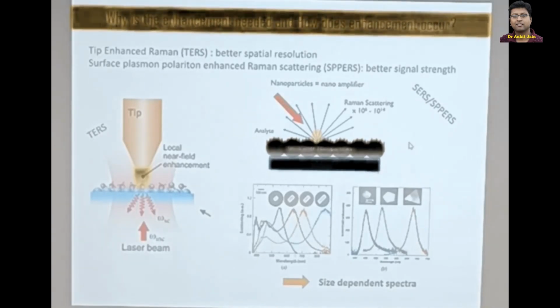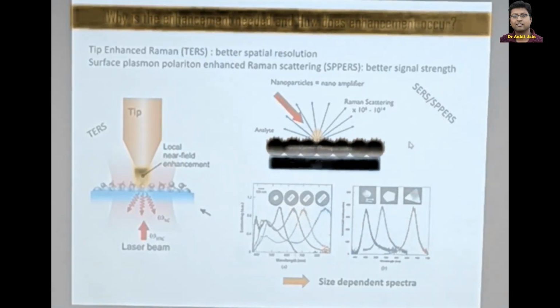So you will have certain kind of gold particles or silver particles which are structured such that their peaks are very nearby, and very nearby peaks of these two structures, what they do is they create hotspots, and these hotspots are localized high electromagnetic regions which will increase your intensity by billions of times, and that will give you a material response much larger than by normal Raman.